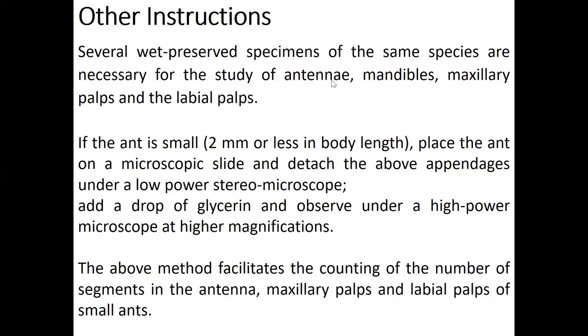So you dissect the antenna, place it in this manner, observe the antenna and count the number of segments. In the mandibles, you don't have a palp. In the mandibles, what you observe is the structure, right?